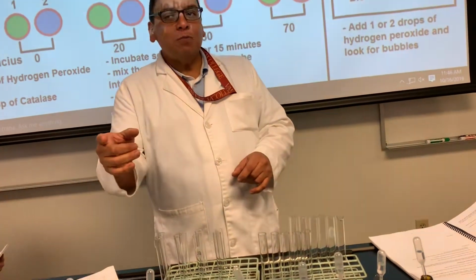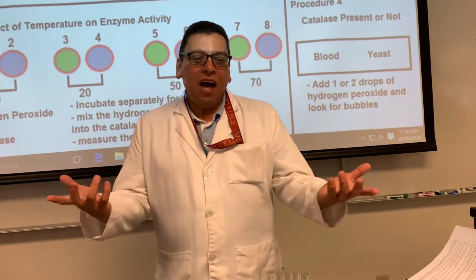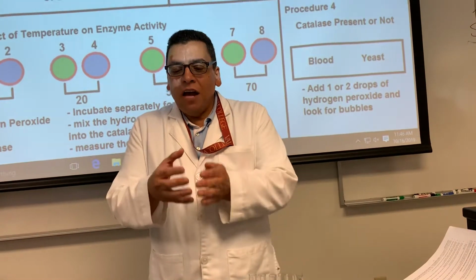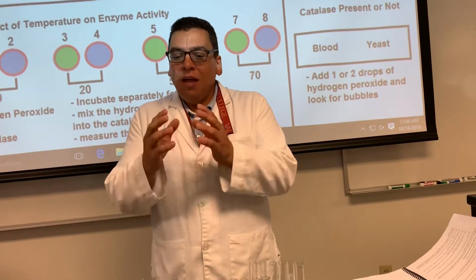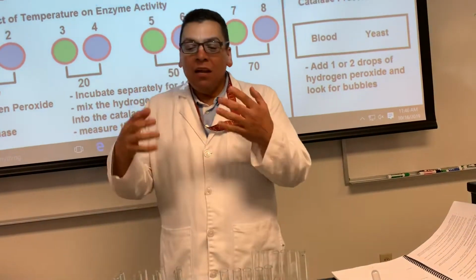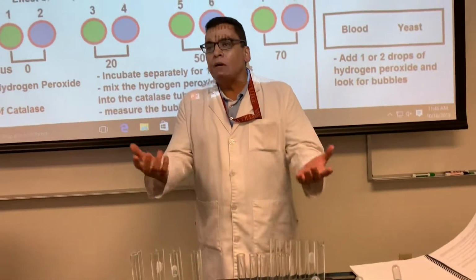But here, we're smarter than bacteria. You know what we do to make sure they're both dead? We use highly concentrated hydrogen peroxide. The hydrogen peroxide that you buy is at a concentration that will kill both of them, the ones that produce catalase and the ones that don't. So you're okay. The whole idea is to avoid infection.